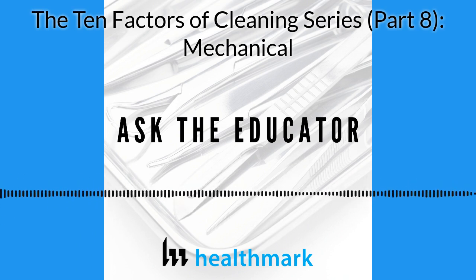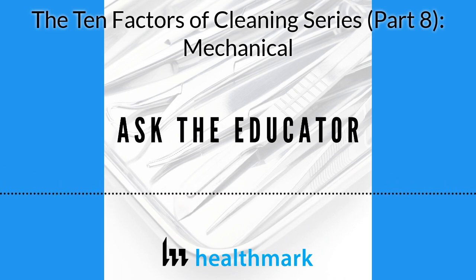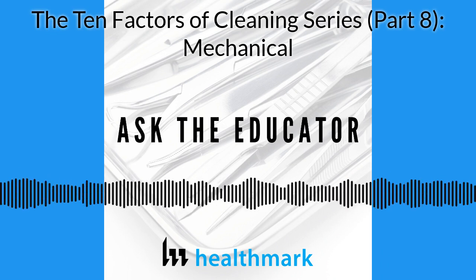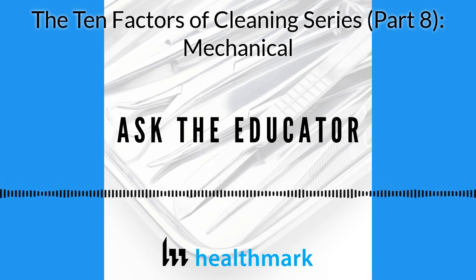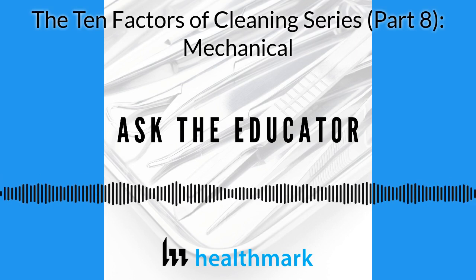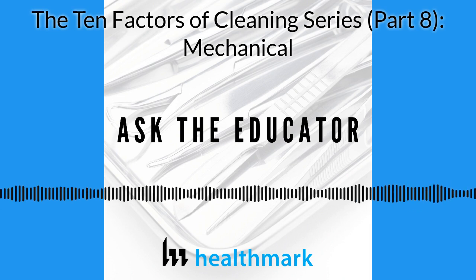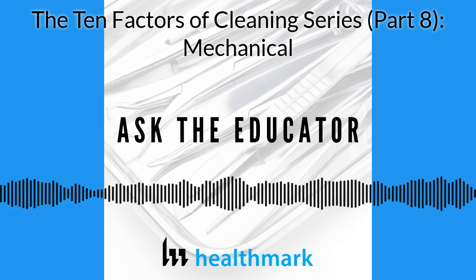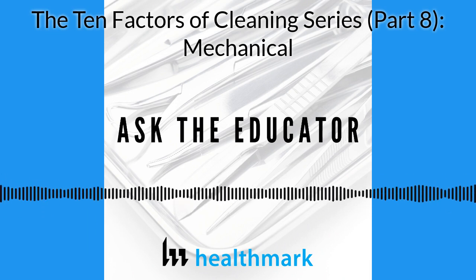I like to tell people, I use the KISS principle: keep it simple, Steve. Think of your spray arms having 10 holes. If 2 are blocked, you're only getting 80% of your cleaning and rinsing. And if some of the other parameters aren't right, like your dilution, it's not going to work. So you've got to make sure the screens are clean, the pump's working, and nothing clogs them, because you want the full power of the impingement, whether it's low pressure or high pressure, right?